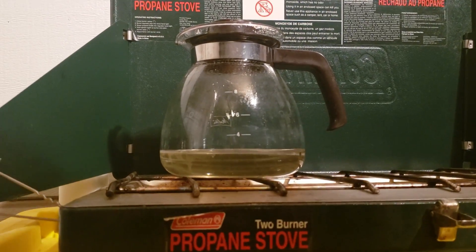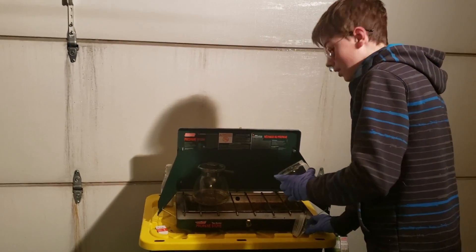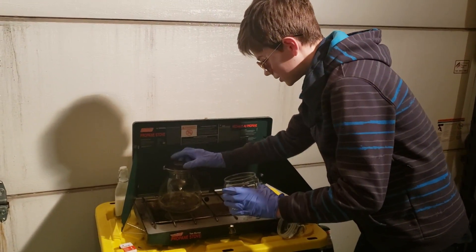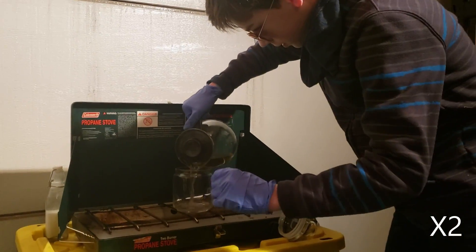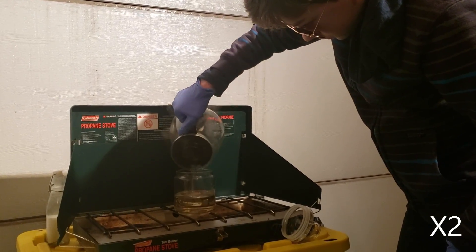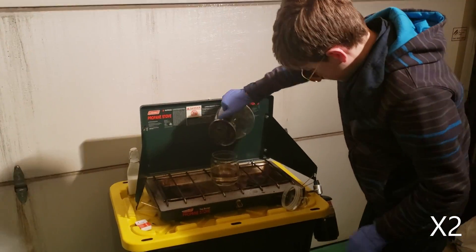I could tell you it's finished boiling down, but we had to boil it down more for the sugar experiment. The reason we have to boil down the car battery acid is because about 20% of the car battery acid is sulfuric acid, and the rest is water, which we have to boil out.